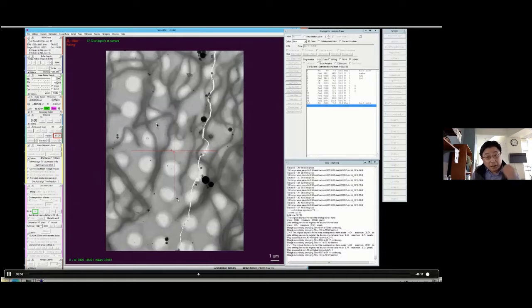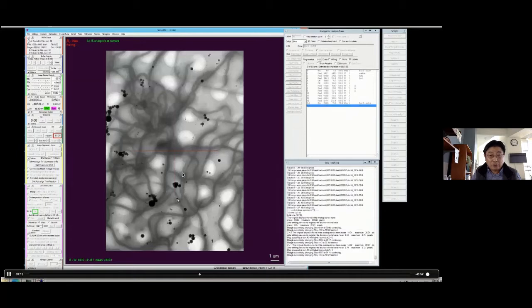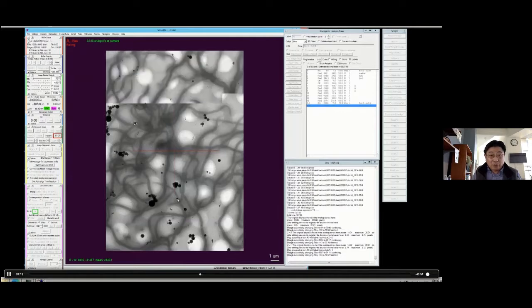Typically, it takes a little bit of time to find them. And again, this is all ice contamination. You can see this droplet of ice in the 2 micron hole. So this basically means that this ice is as small as 0.5 micron to like 1 micron.